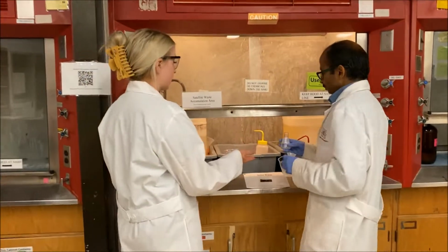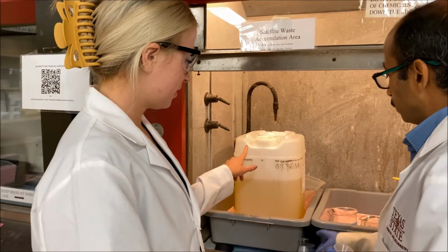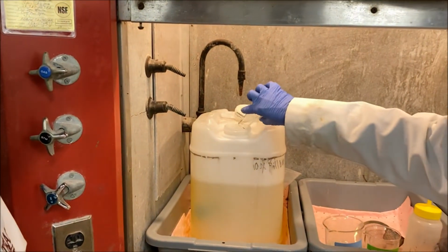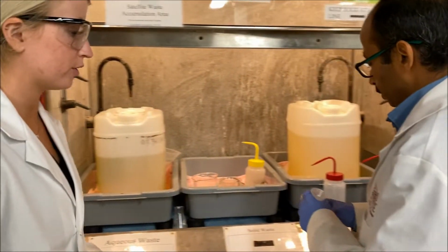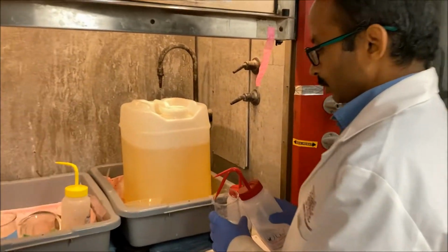What's remaining from your vacuum filtration is going to go into the aqueous waste bin, which is right here. So this will go in aqueous waste. Yes. Perfect. And then for your crystals, you need to dissolve those in acetone, and then you'll dump those into the organic waste bin.